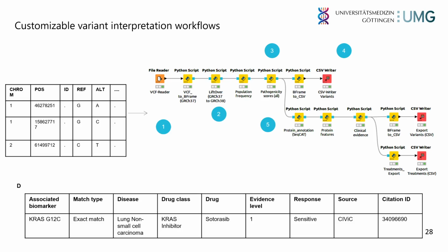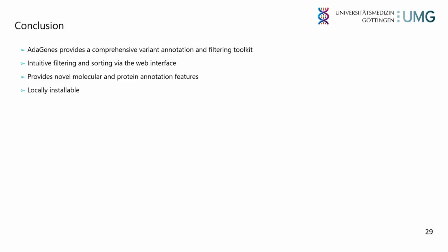So to conclude, we have created a comprehensive variant annotation and filtering system with AdaGenes, which is easy to use within the interactive web application. AdaGenes is also available as a public instance where data is uploaded anonymized.